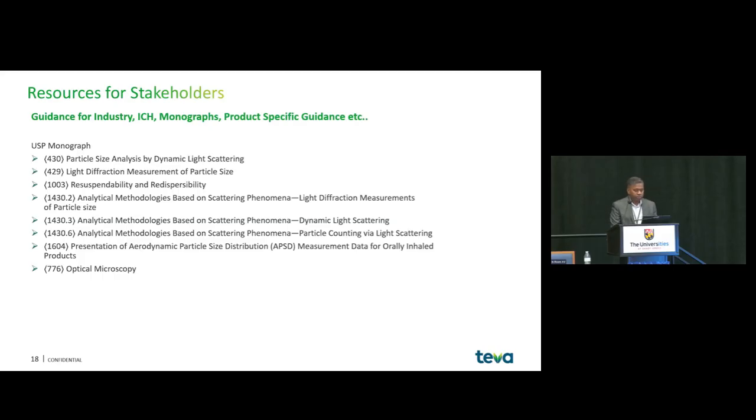You also have the particle counting via light scattering, which is the 1430.6.